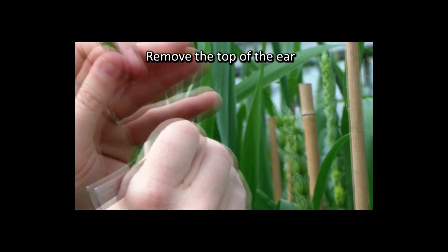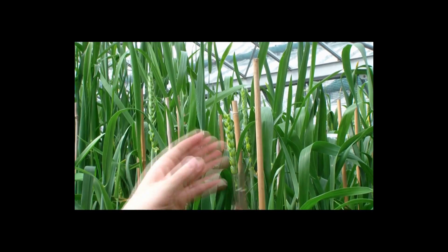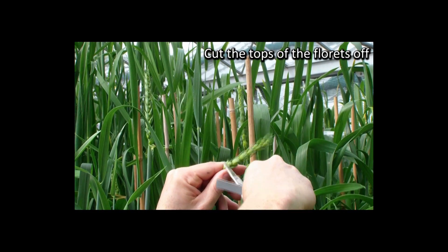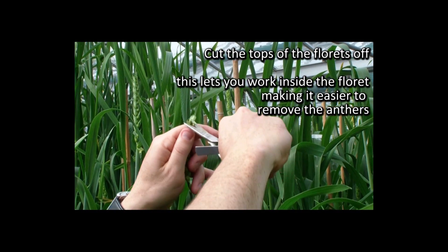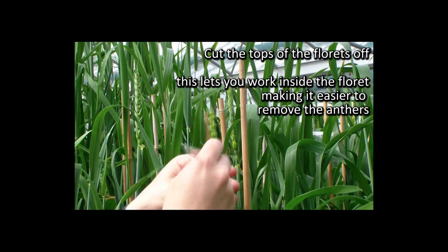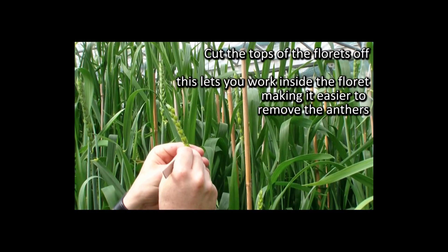Then remove the top of the ear. The next step is to cut the tops of the florets off. This allows you to work inside the florets, removing the anthers much easier.